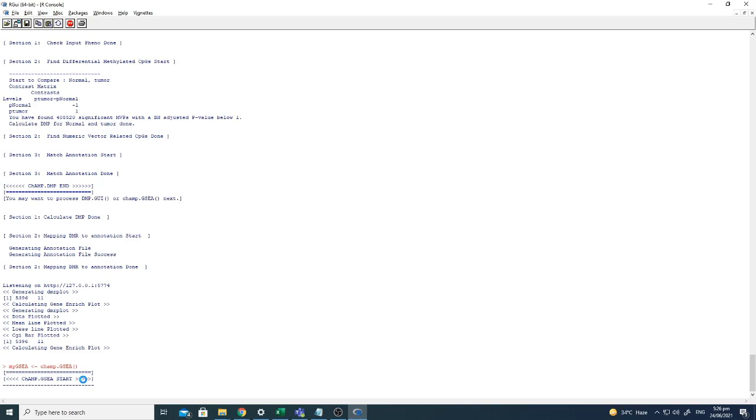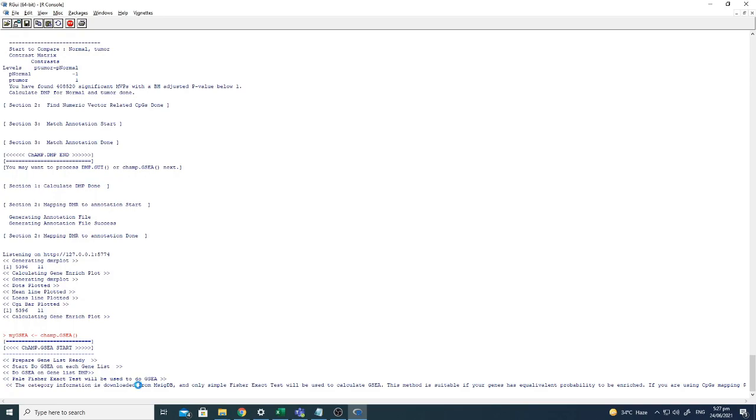When you read these commands, there are a lot of things you would already know, so I think I should stop. I hope that you can follow these steps carefully and perform the differential methylation analysis. You can find the differentially methylated regions or genes or probes, whatever you need to find for your dataset of interest.